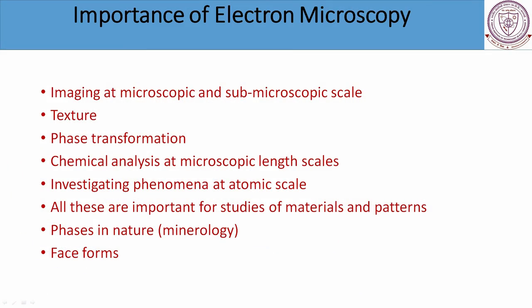In the next slide, I am going to demonstrate the kind of importance that electron microscopy of both variants, the scanning electron microscope and the transmission electron microscope, holds for a variety of studies. Some of them are listed here. Imaging at microscopic and submicroscopic scale. I have already given examples of this through my lecture. One example of texture I have given you, because there was a deformation texture in the scanning electron microscope.